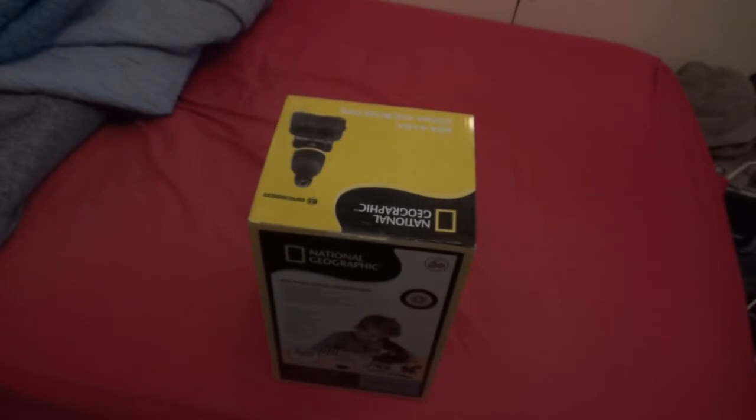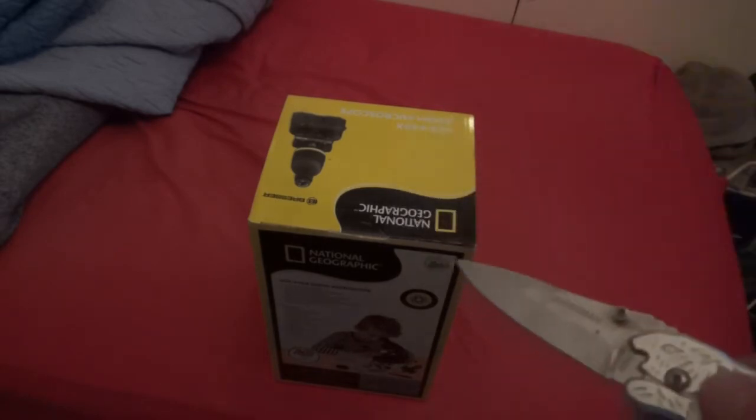So it does actually come with batteries. Like I said before, I am very happy that they actually include batteries with certain items, but unfortunately not all of them.